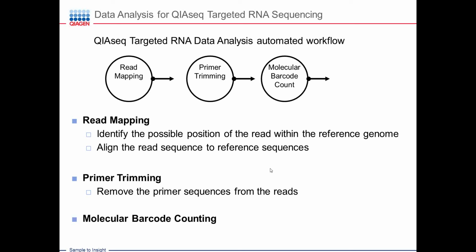So you'll see things in your report that say off target. What it means is that a primer may sit down in the wrong place in the genome and the sequence next to your primer is not right. So once it confirms that it's the right sequence and it's the right size, it's then going to essentially mate the molecular barcodes back to the sequence and count how many unique barcodes are associated with that sequence.